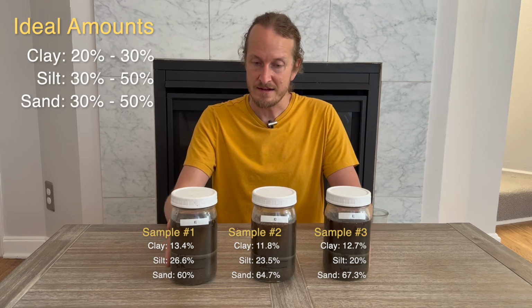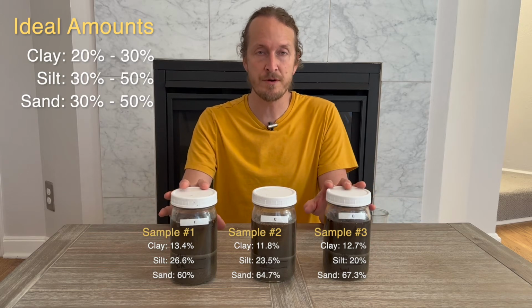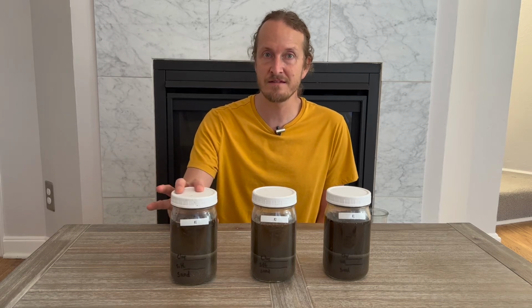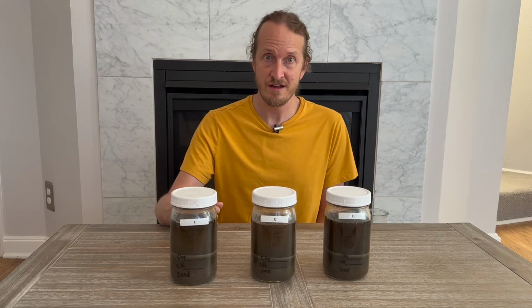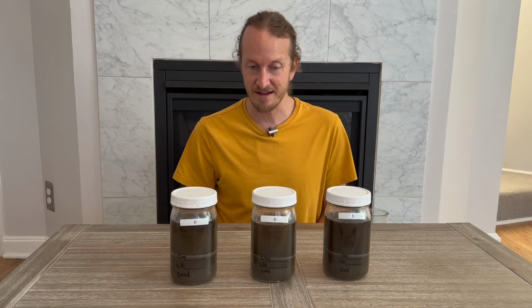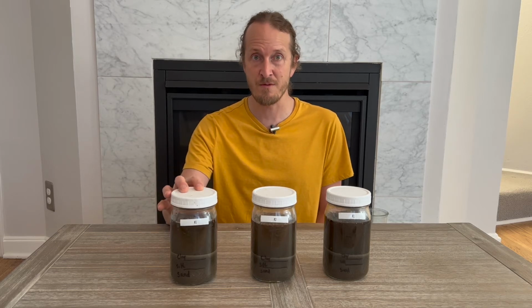So what kind of information does this give us now? We know that we're pretty heavy in the sand, and what heavy sand soil is going to do for us is it's going to have more drainage. This can be a good thing, but it does mean that it may take more water, right? The water is going to drain away a little faster. So we're going to need to have something that really holds that water.